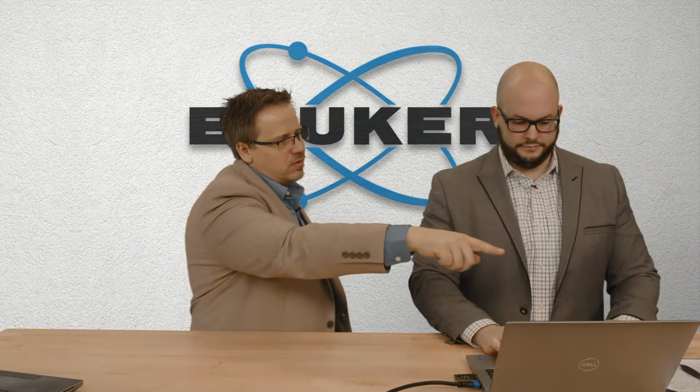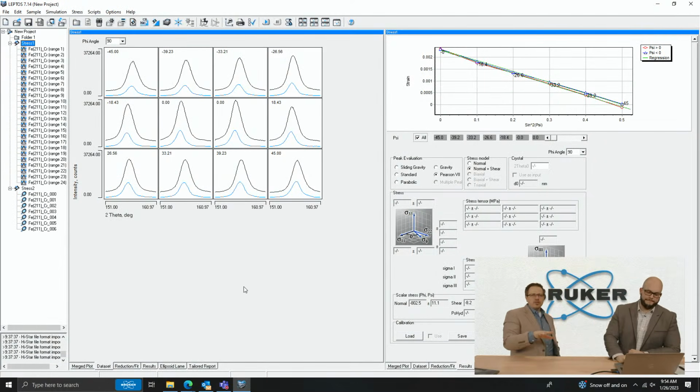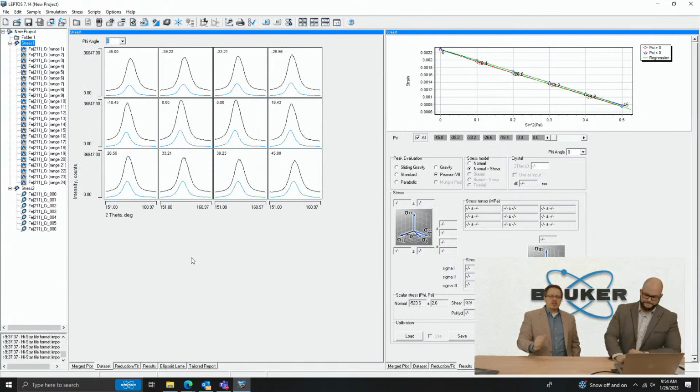So yeah. Another view I like to look at is actually if you go up to the regular stress node. Yeah. And then you see the multi, where you get all the plots. I think it's the second tab. Oh, the merge plot. Yeah, the data set. Yep. This data set, I like to look at that one too. This gives you an idea. If you see anything funky going on, that's going to tell you where your issue is coming from.